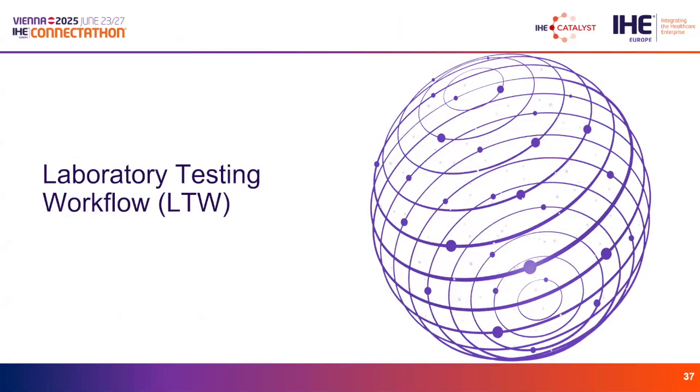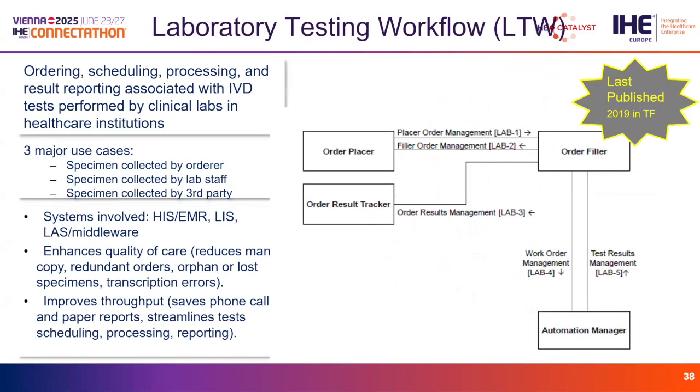Another interesting profile is the laboratory testing workflow that we can consider from the point of view of all profiles of PaLM, such an entry point, because it's related to the ordering, scheduling, processing, and result reporting associated with in vitro diagnostic tests. So the scenario is, for example, the one where an order placer orders some laboratory tests to an order filler, or if the orders are generated inside the order filler.